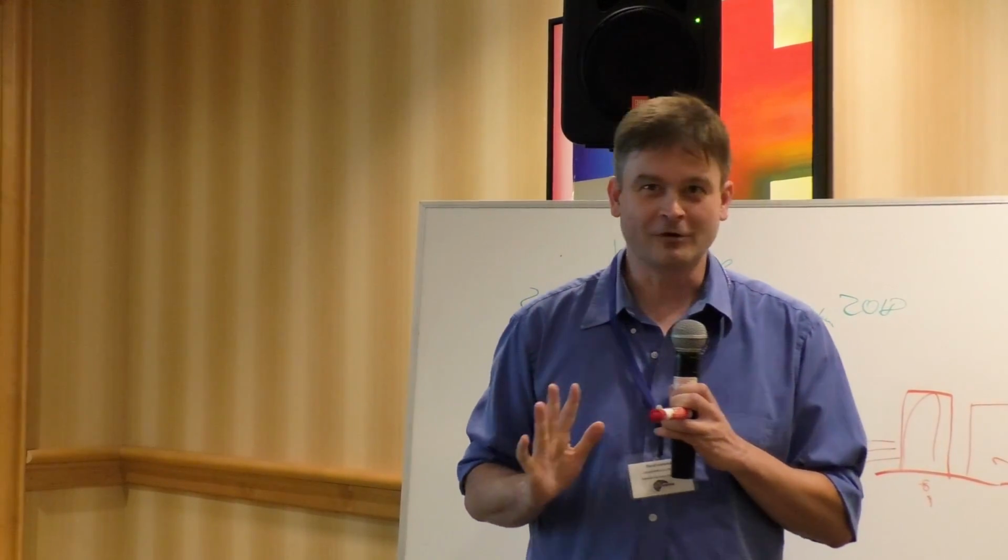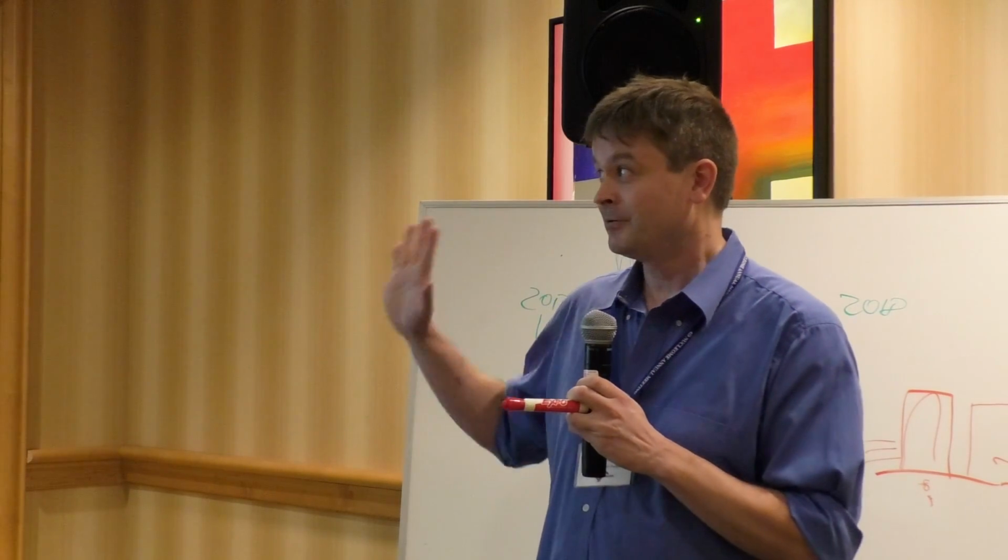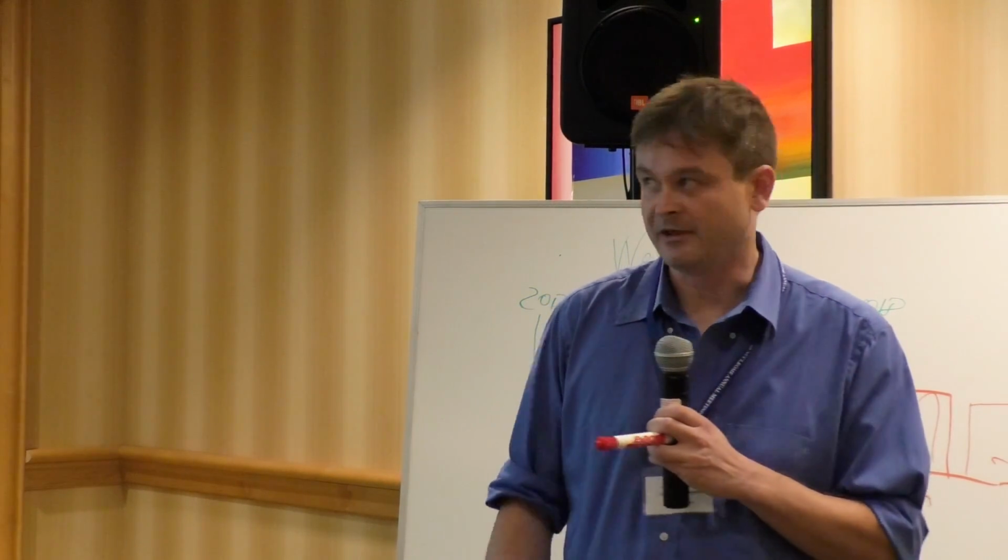We haven't done much more than saying, okay, you are in trouble. Please give us more data. And please do this much more frequently so that we get an idea of what the variances are really in the experiments on a day-to-day basis.